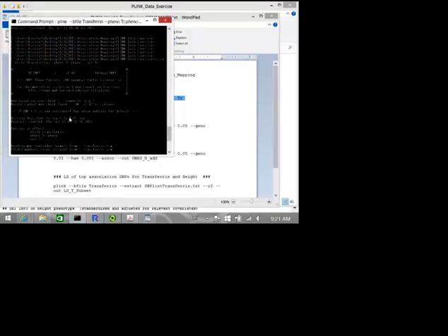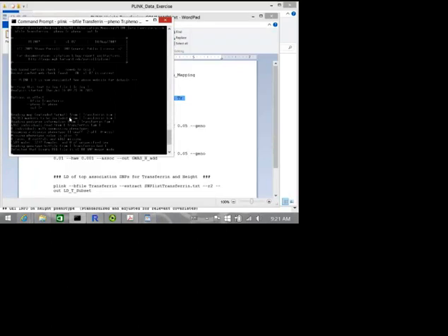Okay, can everyone see that? Now it's running this command, and as soon as you run it, it's getting information. It says reading the map file: there are 281,013 markers and 4,861 individuals. Then this is genotype data, and it gives information on how many males and how many females there are. So it's read it in, and there's some information about the analysis and the options that are in effect: the file, and the output.